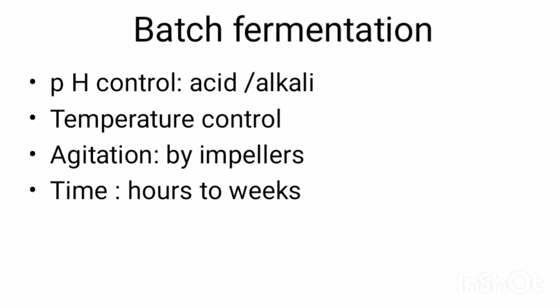Impeller consists of blades. Different types of blades are available. The shaft passes through the lid of the fermenter and it is rotated with the help of a motor.